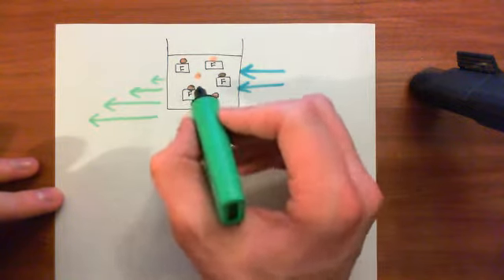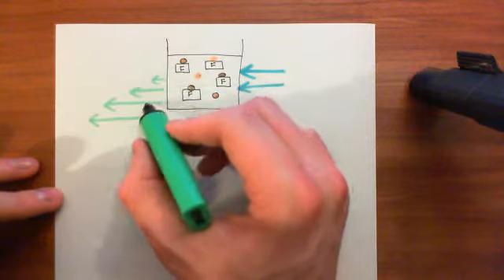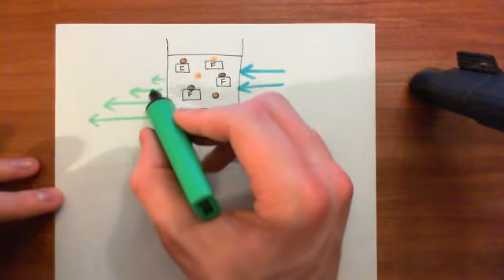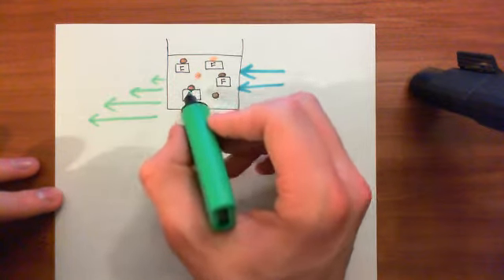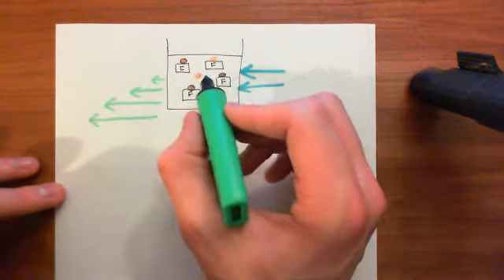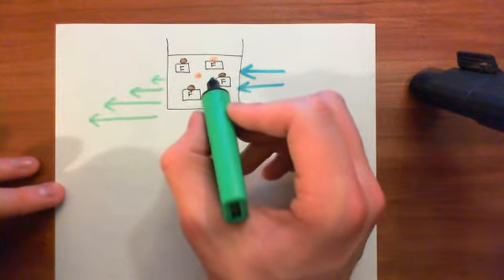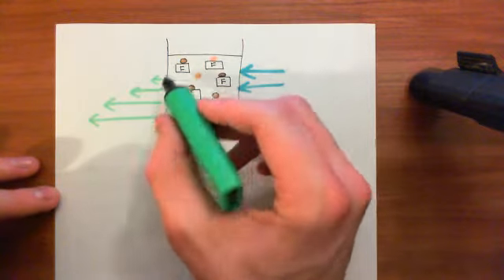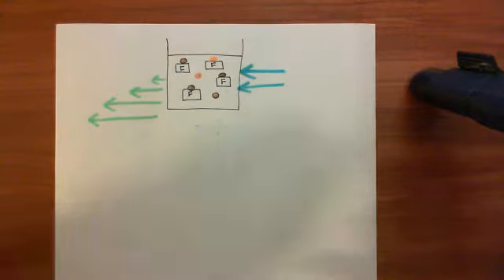But if we're in that range of calcium concentrations where not all of the Fluo-4 molecules are bound to calcium, and thereby increasing calcium increases the fluorescent signal because it's increasing the number of Fluo-4 molecules with calcium bound to them, then we can get some meaningful information out of this. We can use the fluorescent signal to infer calcium concentration within the solution, and that's the basic idea.